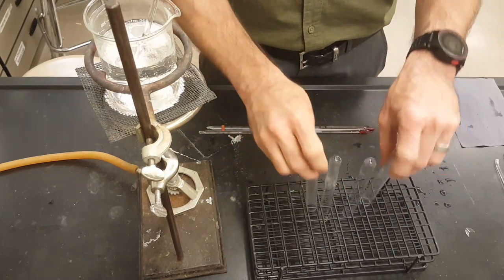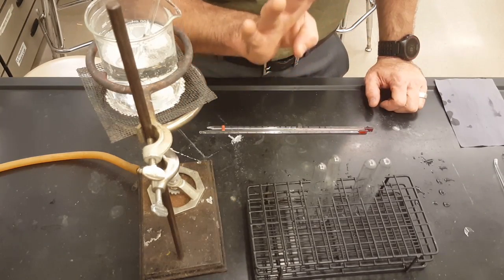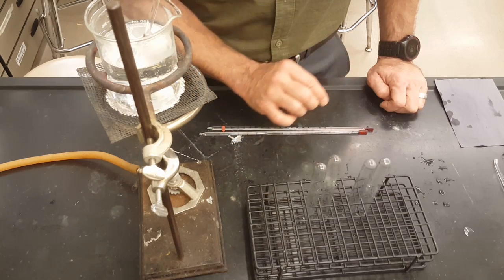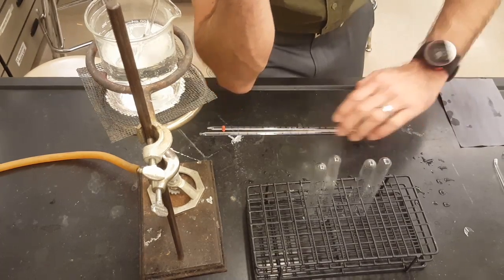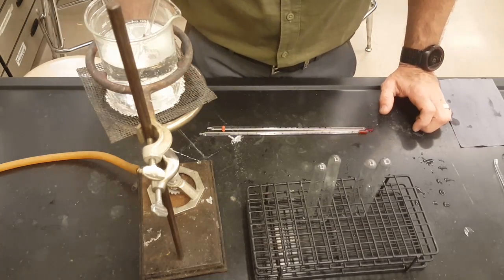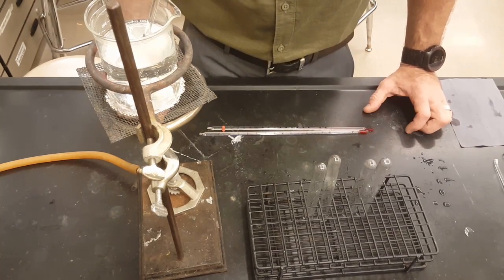and those 4 different concentrations and 4 different temperatures can be used to make a smooth curved graph where you have concentration on the y-axis and temperature on the x-axis. That's going to be your solubility curve, or the curve of the saturation of potassium nitrate in water. Good luck.